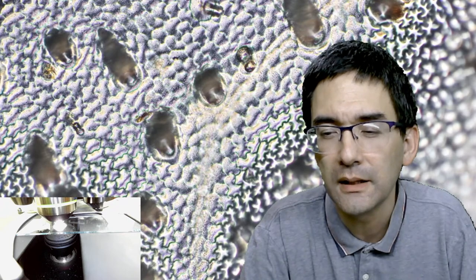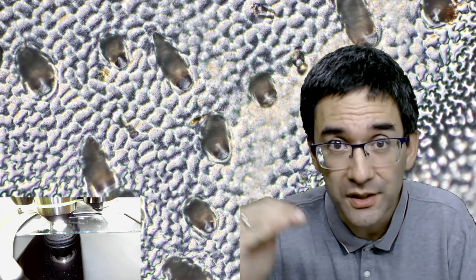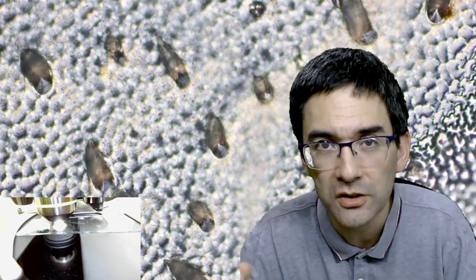The question is whether those little things you see are stomata. I don't think these are stomata because it's a top surface, and generally you don't find stomata on the top surface - that would be counterproductive, there would be way too much water loss because that's where the heat of the sun is. Actually the top surface of the leaf is pretty watertight - the epidermis produces a so-called cuticle made of wax to seal it off.